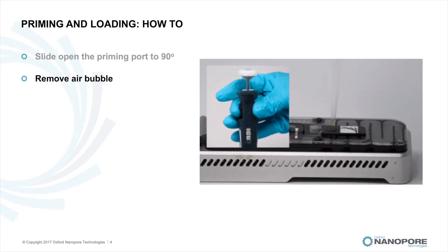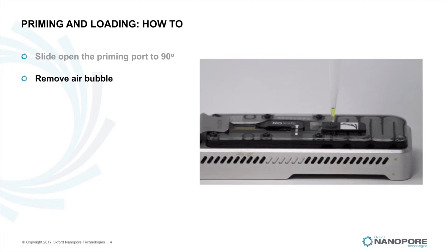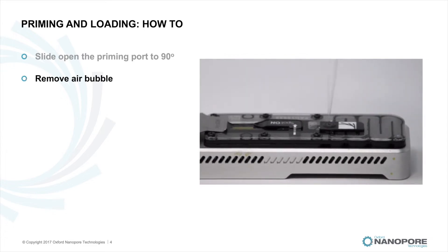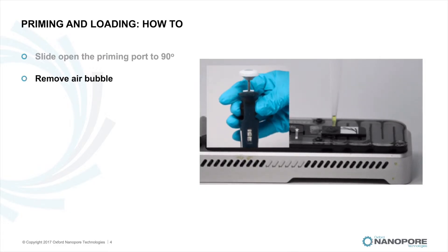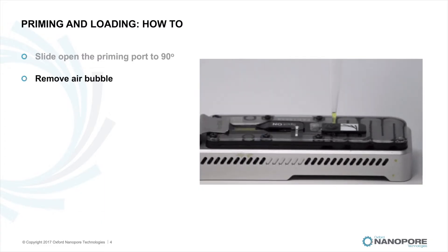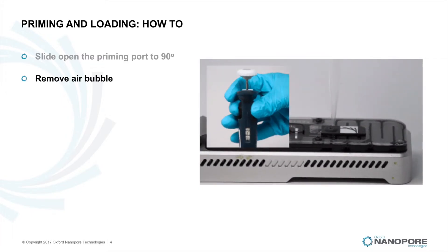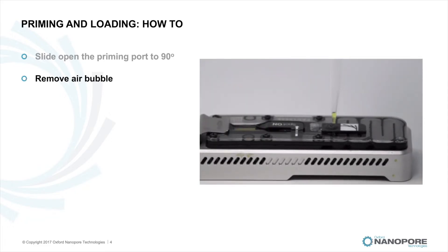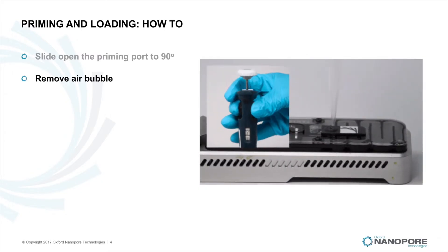Check for a small bubble under the priming port cover and draw back a small volume to remove any bubble. This is done by setting a P1000 pipette to 500 microlitres and inserting the tip into the priming port. Turn the thumb wheel anti-clockwise until the dial shows 520 to 530 microlitres, or until you can see a small volume of storage buffer in yellow entering the pipette tip. Visually check that there is continuous buffer from the priming port across the sensor array.